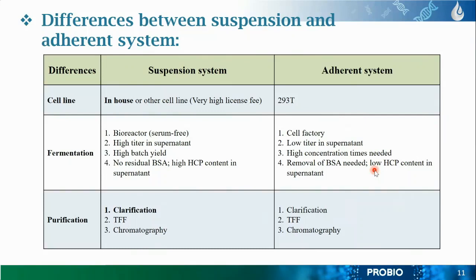Especially when it comes to the suspension system, we use an inline system, and we also use commercial cell lines, which come with very high license fees. So we use our in-house built system, especially with HEK 293 or 293T.